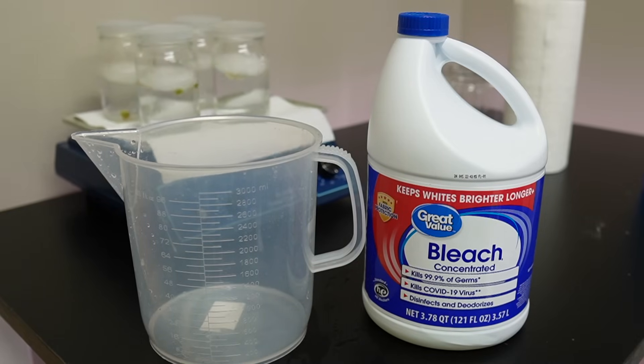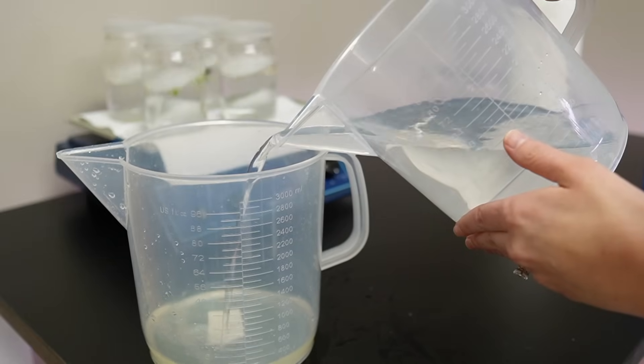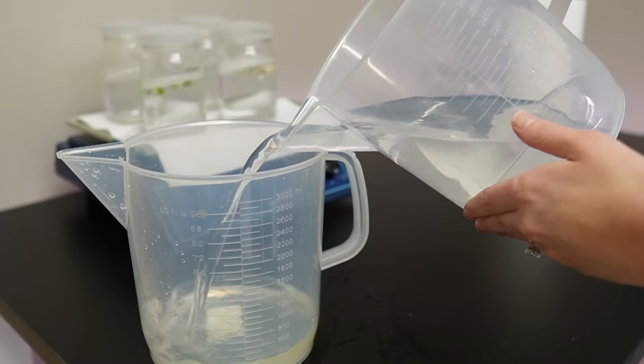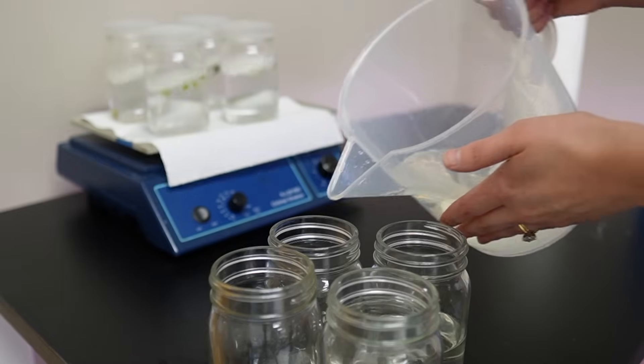Cacti and succulents are easy to tissue culture compared to other plants because they're a lot hardier and can handle a higher concentration of bleach than leafier plants like philodendrons and monsteras. To sterilize the explants we just took, we are going to mix up a solution of 20% Clorox bleach and 80% water. I'm going to leave these explants in the bleach solution for about 20 minutes.